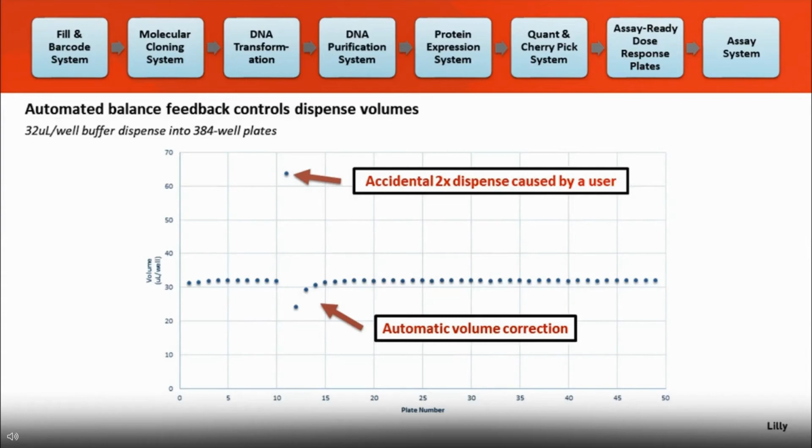So just very quickly, the user I was working with hit retry. And so it already had 32 microliters per well in the 384 well plate. And so the retry is going to redo that dispense. And so now you have 64 microliters per well. And so then he was going around like, oh, we need to stop the screen, we need to fix things, and we'll start it back up, et cetera. And I pulled him back and said, no, this is the beauty of what we just worked with Beckman to build into the system. Watch the system and just let it go.